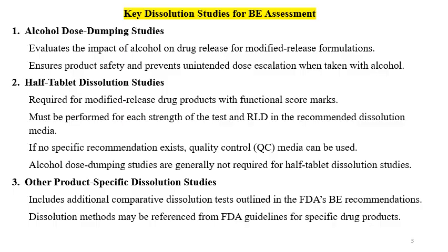Half tablet dissolution studies. Split tablets are required to be tested for dissolution. It is required for the modified release products with functional score marks, and also for the immediate release formulations with score marks. It must be performed for each strength of the test and the RLD in the recommended dissolution media. Presently a specific recommendation is not there for half tablet dissolution studies, but based on the QC media, the dissolution studies are performed.